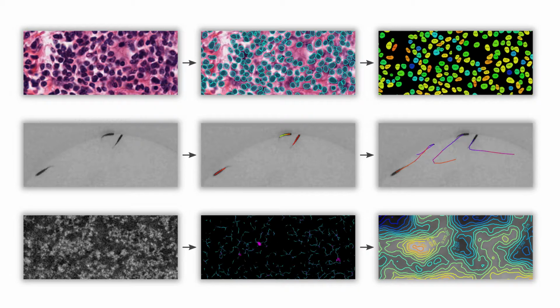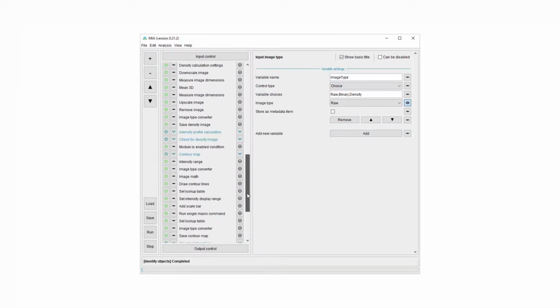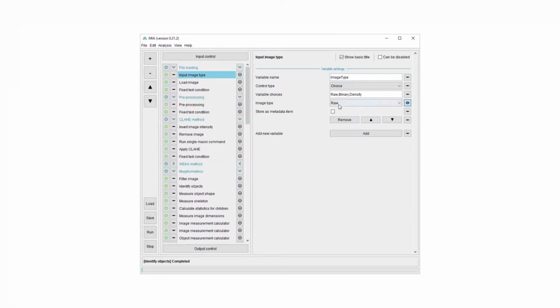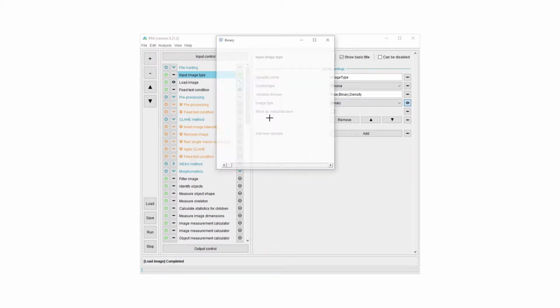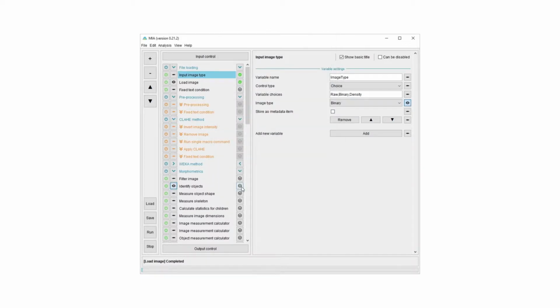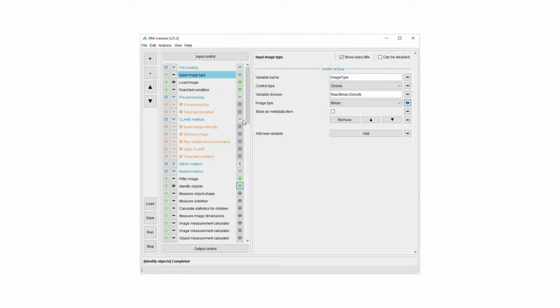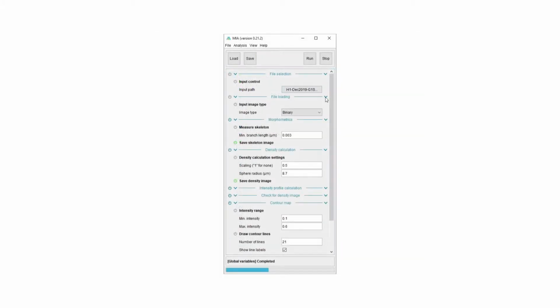MIA has been designed with both workflow creators and end users in mind. For workflow creators, there's the editing view, which provides an environment in which to add and arrange the full collection of near 200 modules into workflows. These modules span operations from image processing to various object detection algorithms, options for relating and filtering those detected objects, and a collection of visualizations.